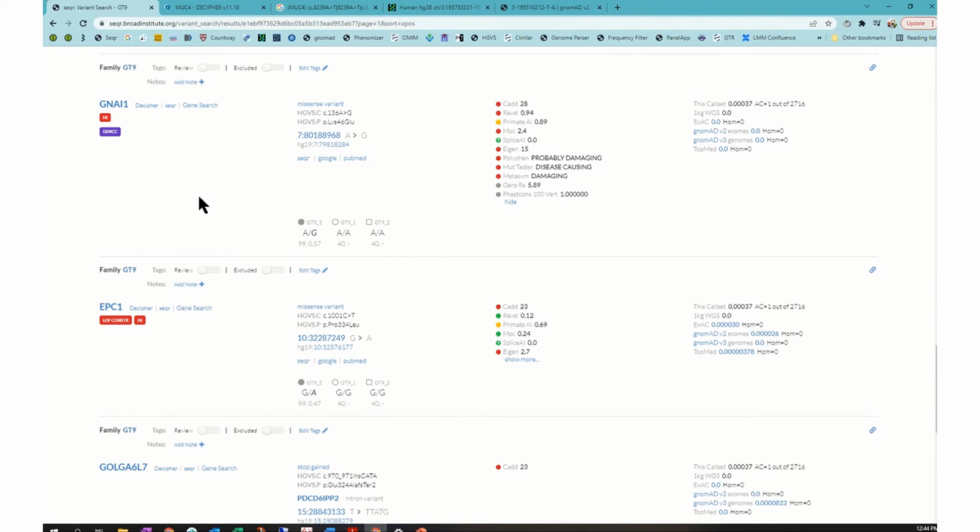This is something I would start to look into the gene-disease association for our patient. So again, we're looking for an intellectual disability, hypotonia, seizure type phenotype with maybe some growth restriction. We can see that this gene is haploinsufficient. And if we hover over this tag here, this is a tag from GenCC, which, as I mentioned earlier, is a database of gene-disease associations. And we can see that ClinGen has actually categorized this gene as definitive for a complex neurodevelopmental disorder.